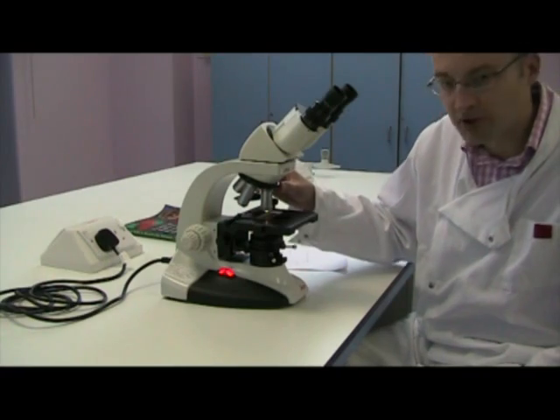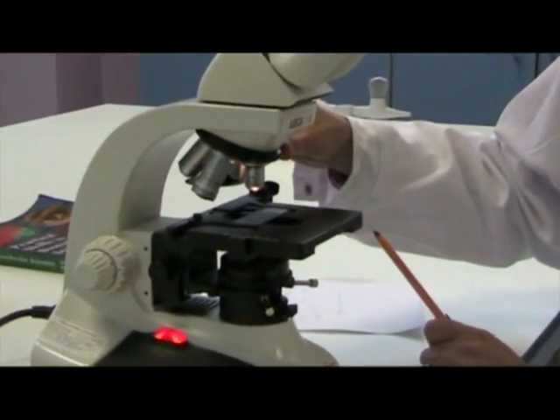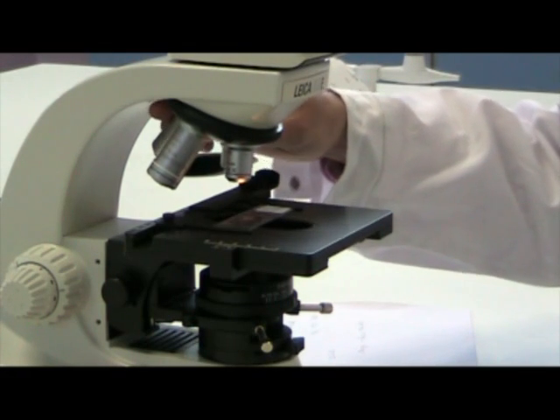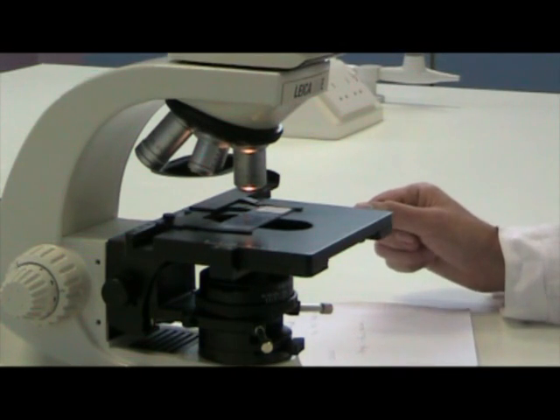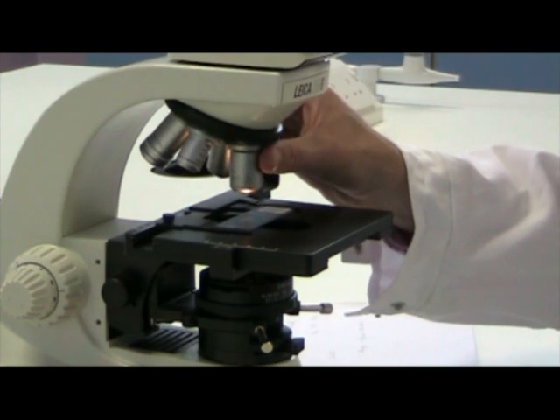Secondly, you need to change between objectives very carefully. This microscope has a low-power objective of times 4 or times 10, so it's got two quite low-power objectives. The times 4 is usually red, the times 10 is usually yellow, and high-power objectives of times 40 and times 100. When you change the objective lens, make sure you hear it click into place over the specimen.